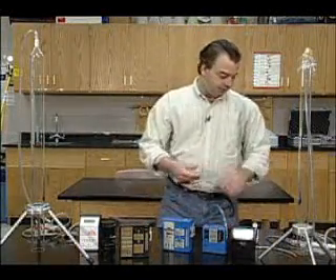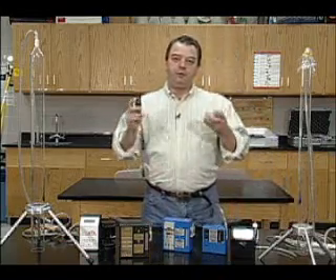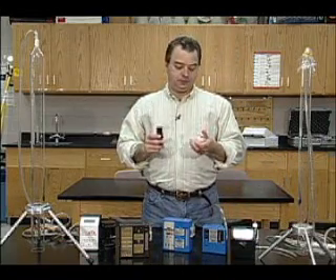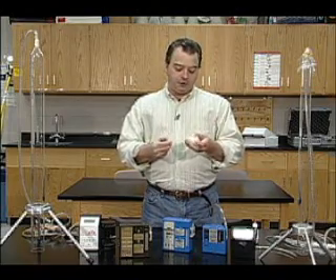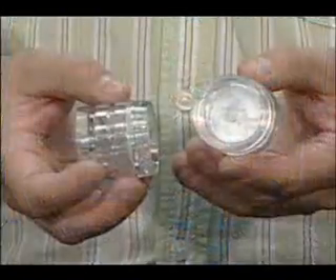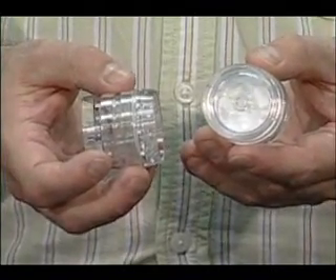A couple of different types of sampling media we use. First, we use filters. Filters are used for dust and fibers. This is what's called a closed face filter. This is used for dust — mainly metal dust is the most common: lead, arsenic, etc.